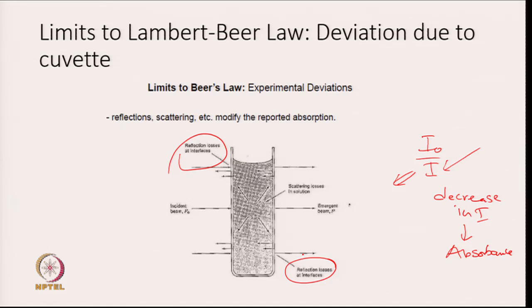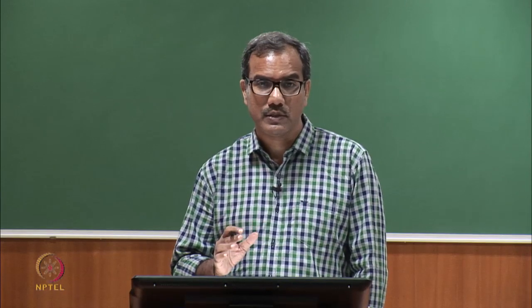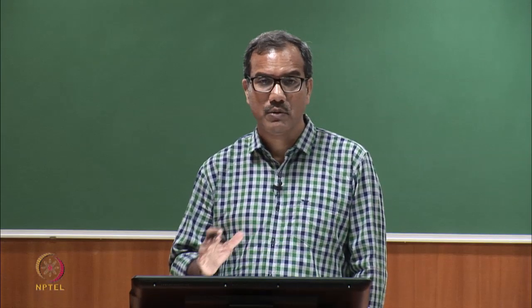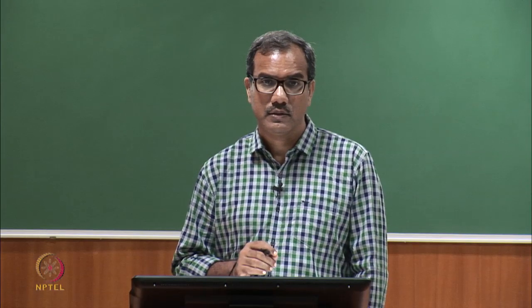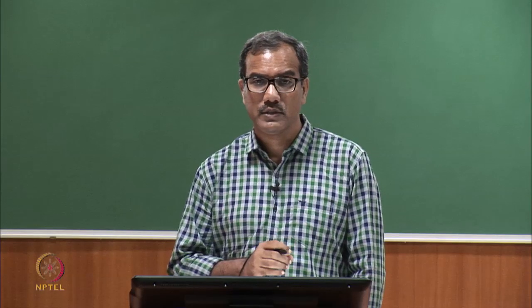Then what can also happen is that there is, suppose, dust particles in our solution, our sample, they will scatter the light. If there are bigger particles in the sample, they will scatter the light. So, light can be lost by processes other than absorption.